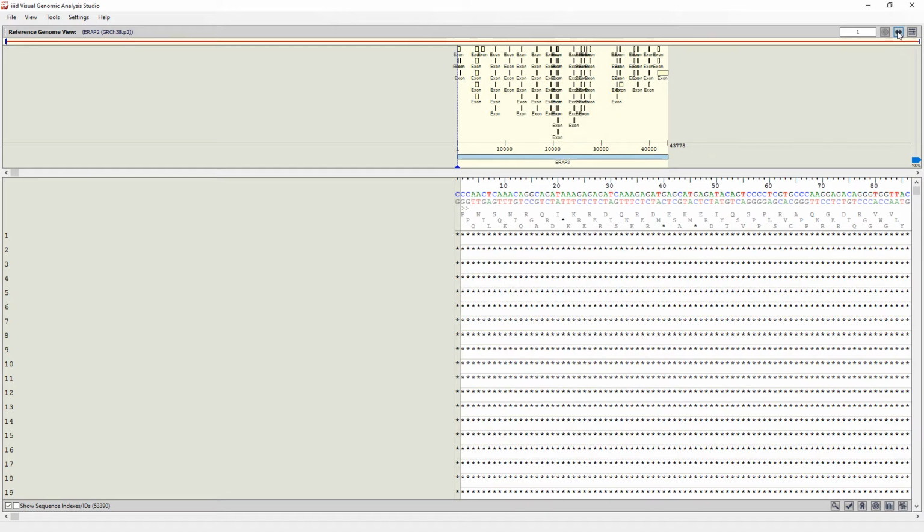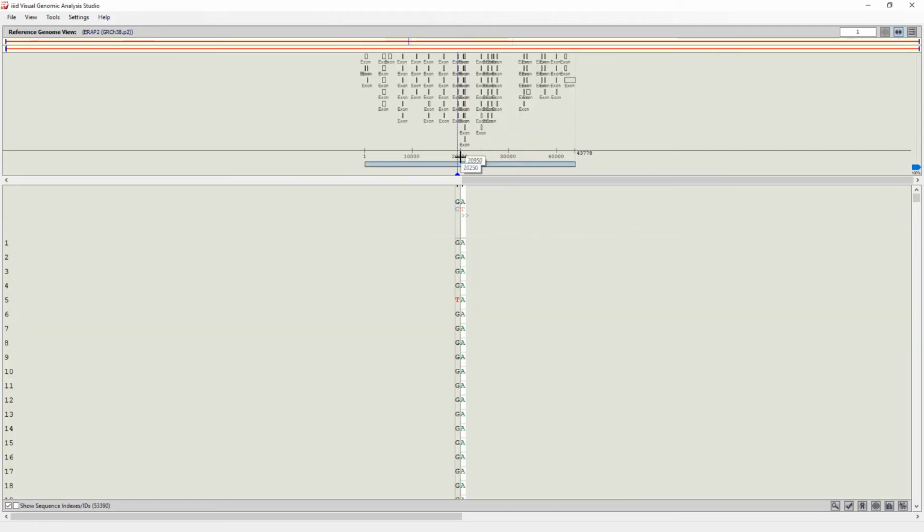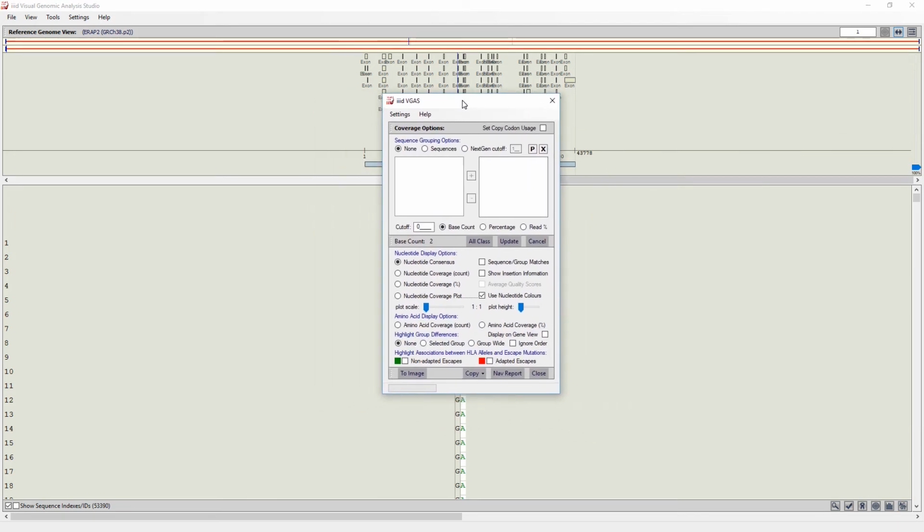Select the location button, set location button on the top right, select the cell, paste, set locations, select the coverage consensus button on the bottom right, set the cutoff to 5 read percent, select next gen, select all the sequences or samples and hit the middle button.